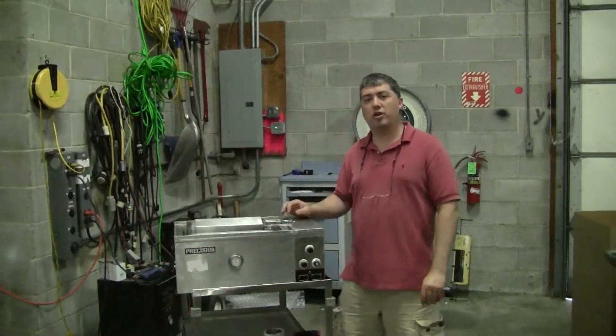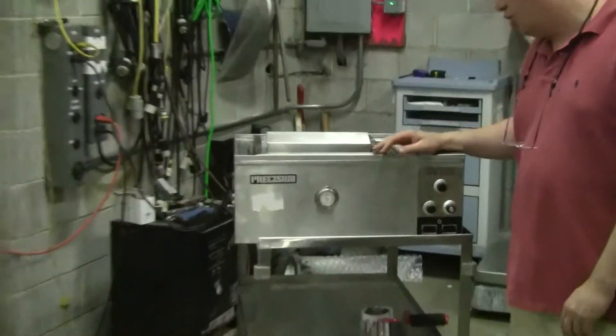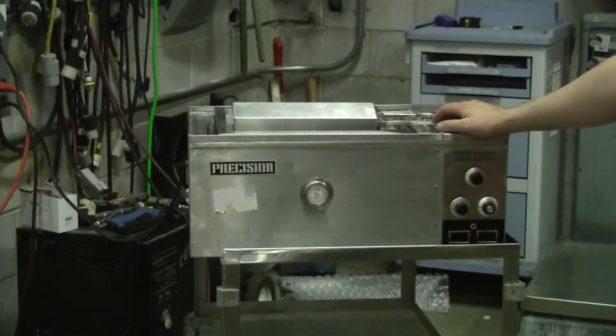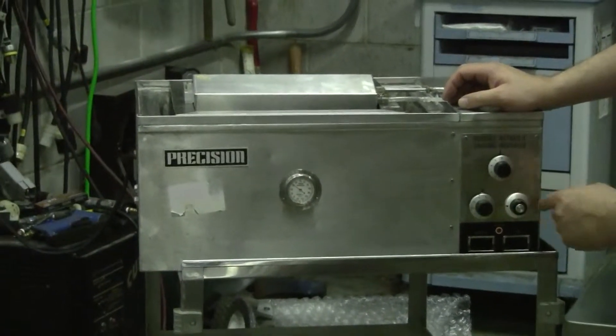Hi, this is Michael Nathau from Hitechtrader.com. Today we're looking at a precision shaking water bath, a classic control mechanism. You have high, medium, and low heat.